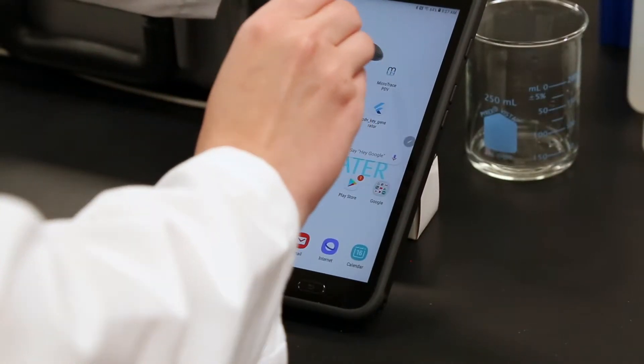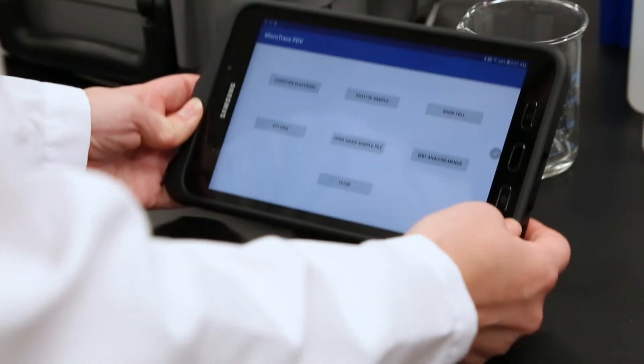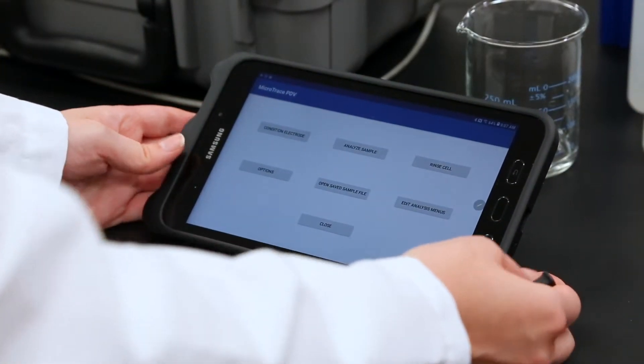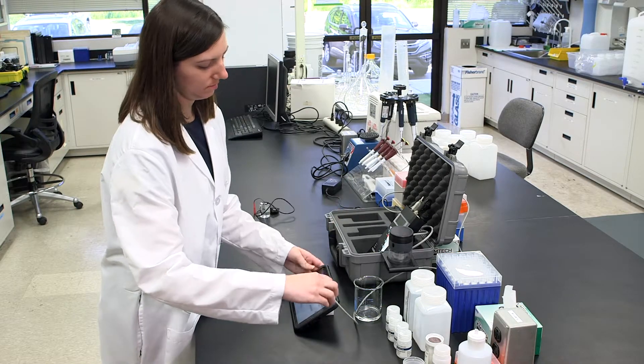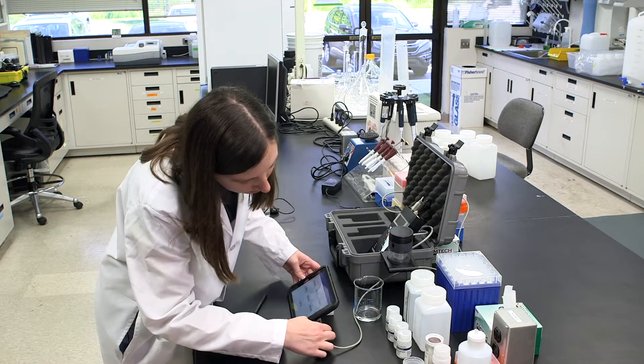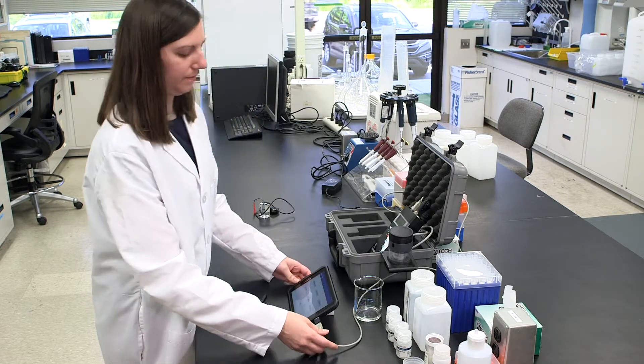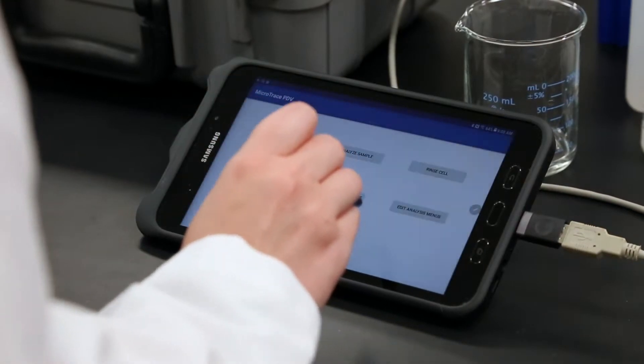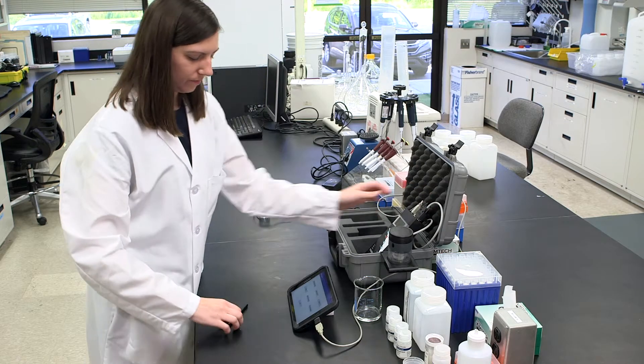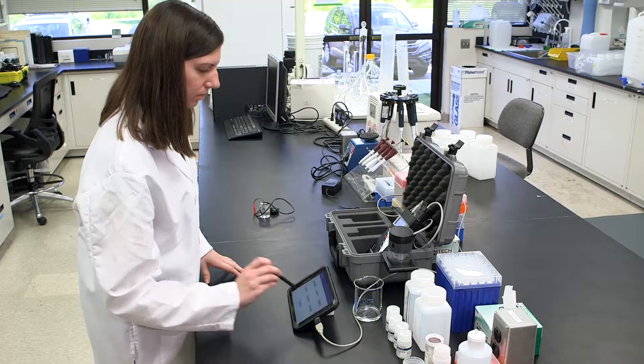Start the app on the tablet before connecting the USB cable and OTG adapter. The main page of the app should open. Connect the USB cable with OTG adapter. A pop-up will appear after a few seconds asking permission for the app to use the USB port, which needs to be accepted.